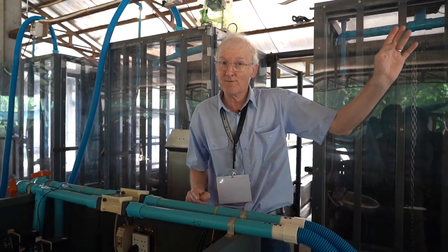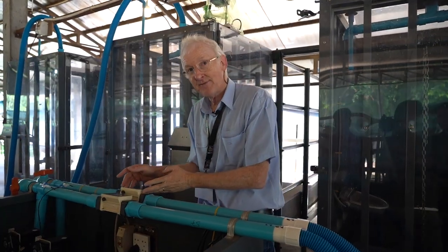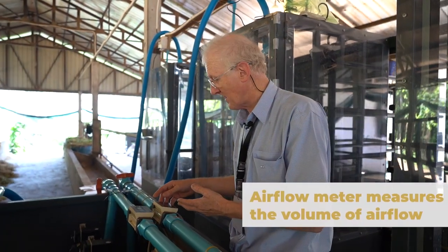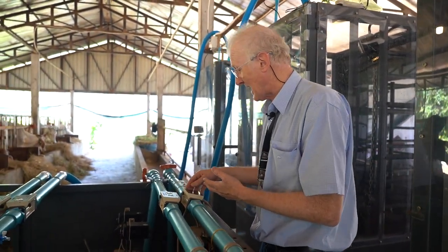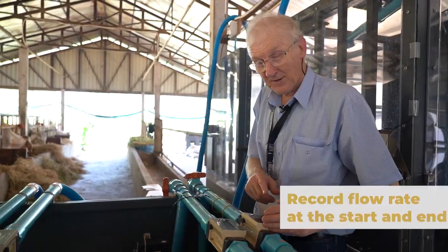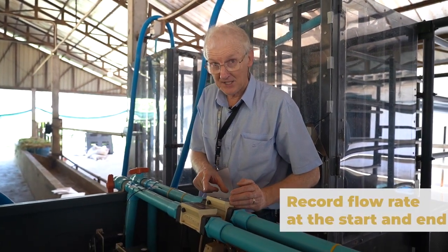We should have had a little filter up the top to make sure the air is clean, because here is an airflow meter, and it is recording the volume of air flowing through per minute, or per hour in this case. As the air flows through, we record the flow rate at the start, and we record the total flow at the end of our time.